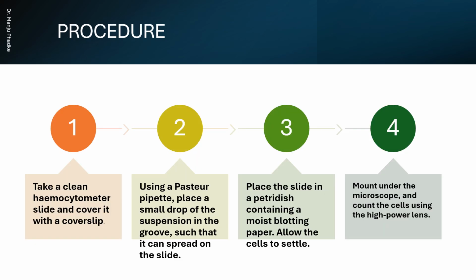The hemocytometer slide can be cleaned with a brush and covered with a cover slip. If we are using the WBC chamber, then like I said before, we have to count all the 4 WBC squares, each being further divided into 16 squares. If we are using the RBC square, then we have to count the corner 4 RBC squares and the one in the center.